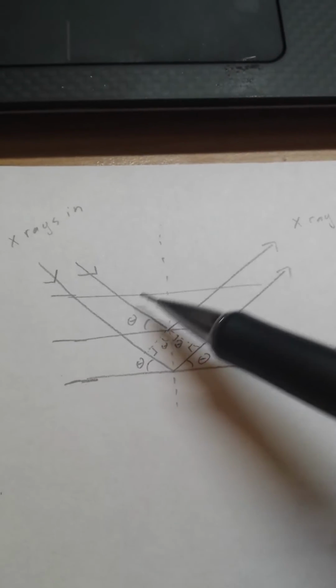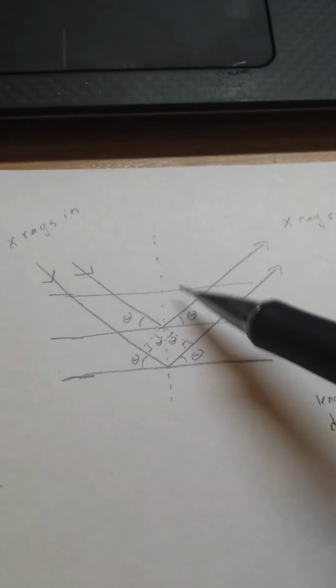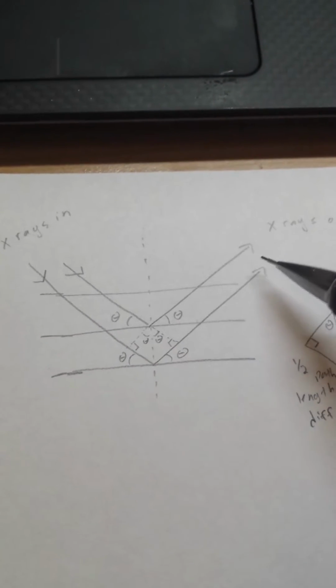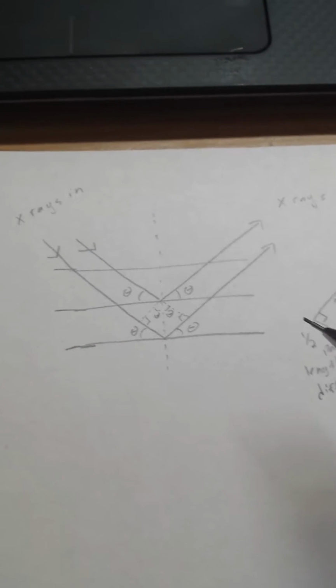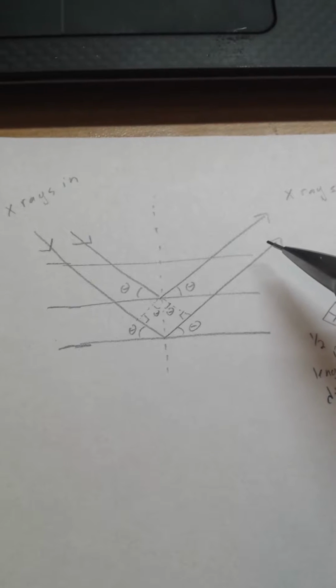So what Bragg discovered is that X-rays are the perfect light to pass through the different planes and then bounce off in predictable ways. In this diagram, each one of these lines is a different X-ray, and they come back. Since each of these planes in the solid are parallel, the angle in is the same as the angle out, and they arbitrarily pass through some planes and bounce off of others, which is why this X-ray went through this plane and the other one bounced off of it.